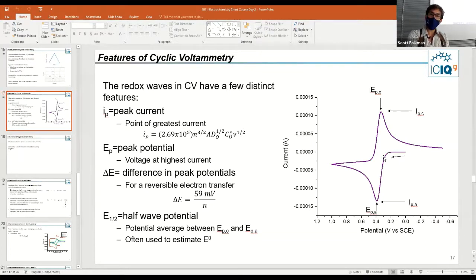Now, you probably know that the maximum rate of change here is going to be somewhere in the middle of here, right? This is a little bit of a sigmoid. So you're going to be looking at the maximum rate of change here in the differential pulse voltammogram. That's going to be the new peak, right? This is going to come up, it'll peak right here, and then as this decreases, as the cyclic voltammogram continues to evolve, the slope will go back down.